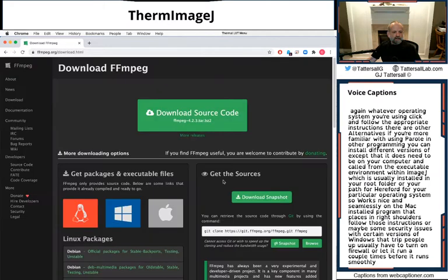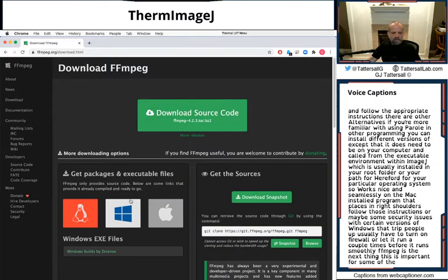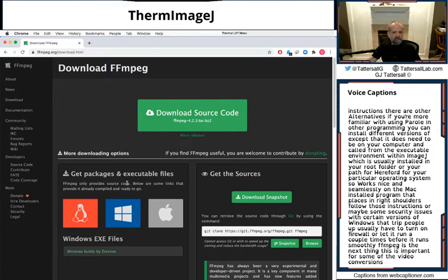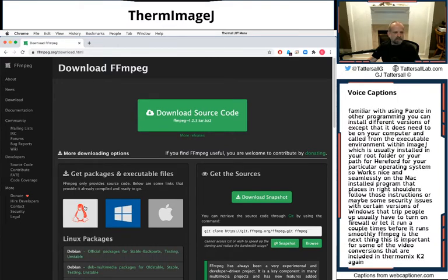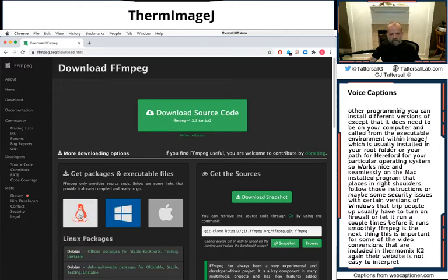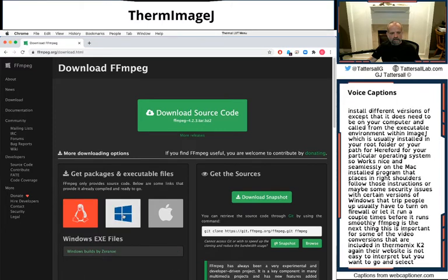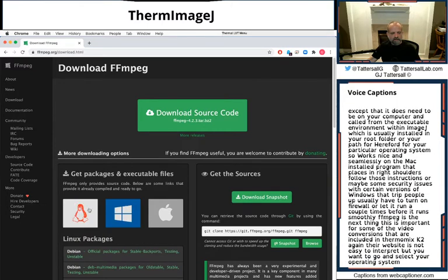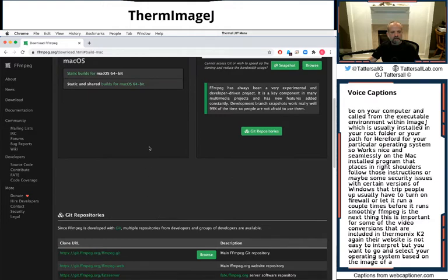FFmpeg is the next thing. This is important for some of the video conversions that are included in ThermImageJ. So again, their website is not easy to interpret, but you want to go and select your operating system based on the image. Or go to Mac. The easiest is just to go to this link here, static and shared builds.